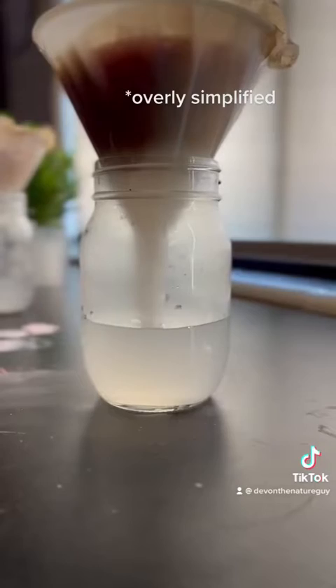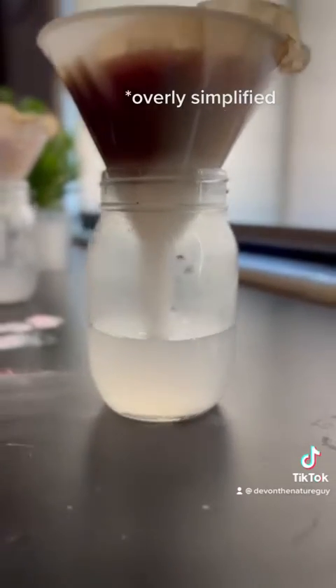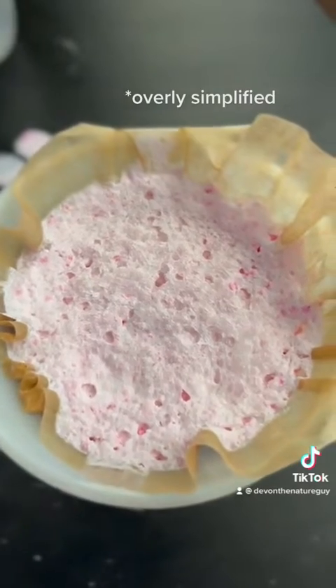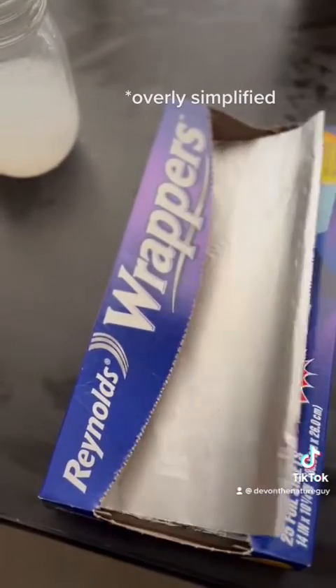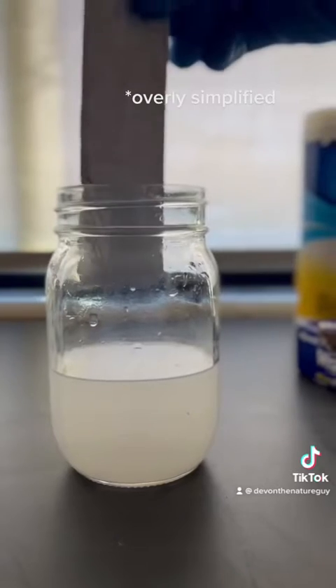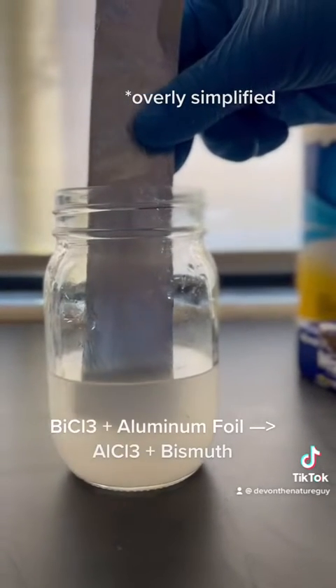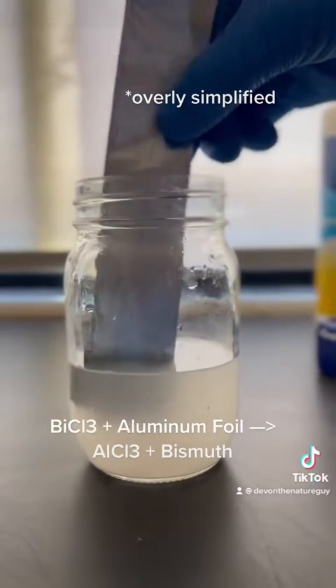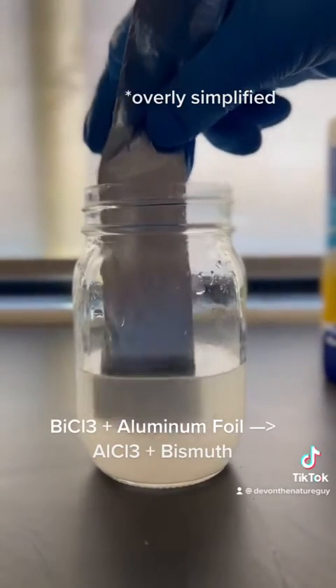It's kind of messy, and what you'll have drip out the bottom will be a mix of salicylic acid — the acne treatment — bismuth chloride, and water. Take a piece of aluminum foil, fold it up, and slowly put it into your clear solution. What's happening is the aluminum is bonding to the chlorine, freeing up the bismuth.